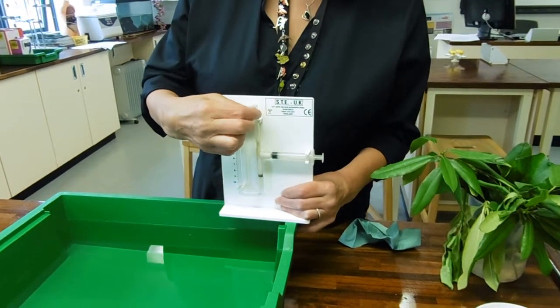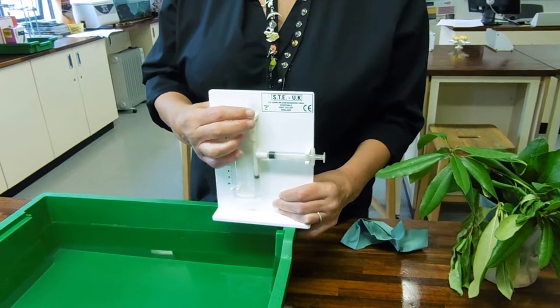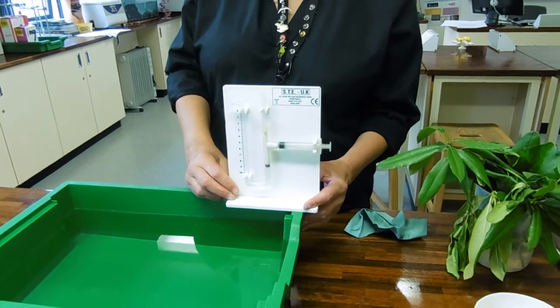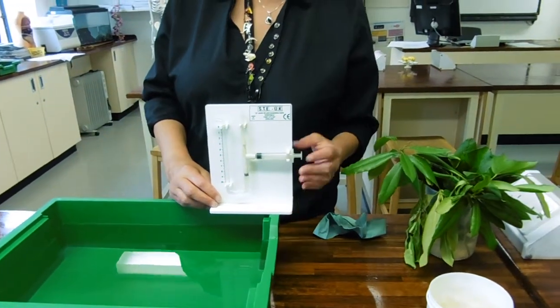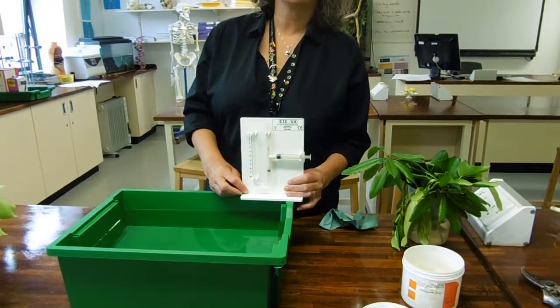And they've got an area where you would attach the plant. So, things you need to know about the photometer: what it's used for is to measure water uptake. What you're assuming is that all the water that's taken up by the plant is actually leaving through the stomata.